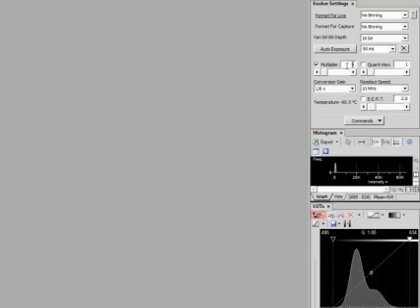And I'm going to apply, so that's no EM gain. I'm going to apply like 100x EM gain just to reduce the read noise to about 4 electrons. Okay, so that's pretty nice. And we're now fully in EM mode, which is great. And I've got a histogram here. So what else could I do?